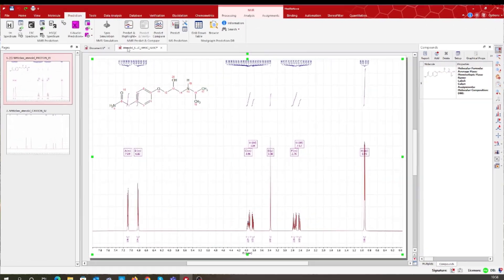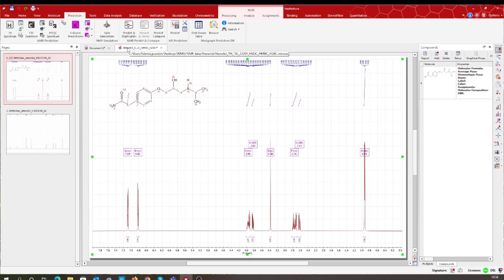Let's now take a second example in which you have available the experimental data and the suggested structure. Here again, you will be able to predict the NMR data of your suggested structure.